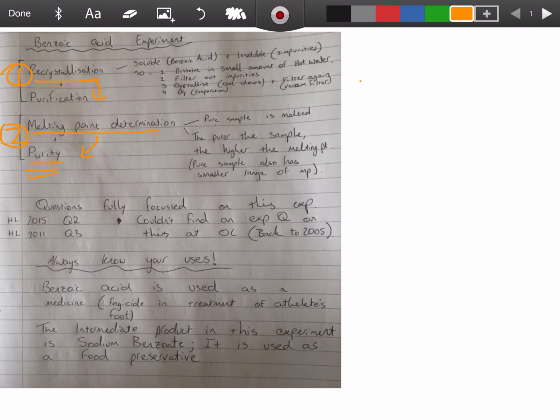You can see there, the first part, as I've said, is the benzoic acid that we make from the intermediate product, which is sodium benzoate, and I'll touch on that later on. You can see that down the bottom there. That is the soluble part, so that's the bit that's going to dissolve. The insoluble parts include the charcoal.